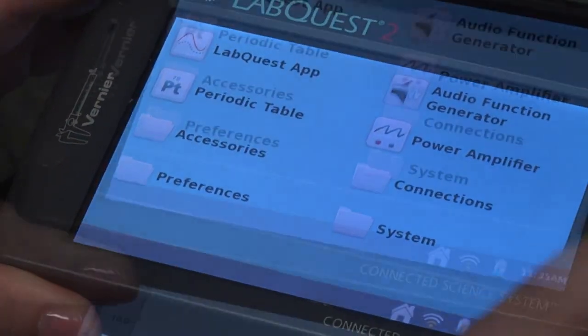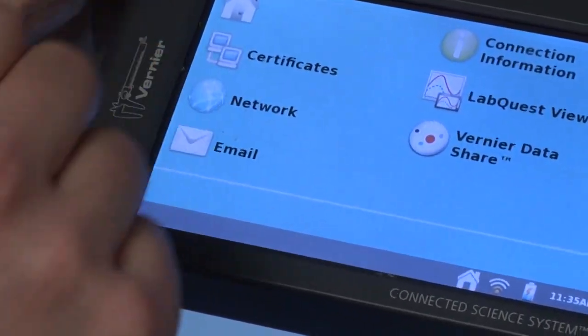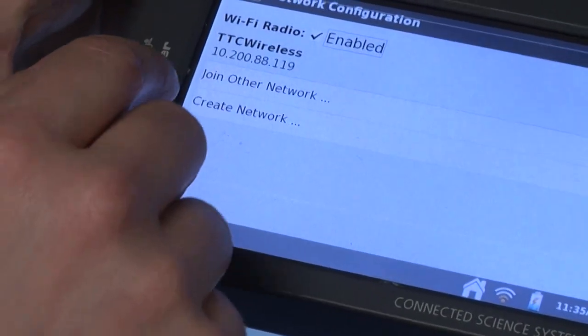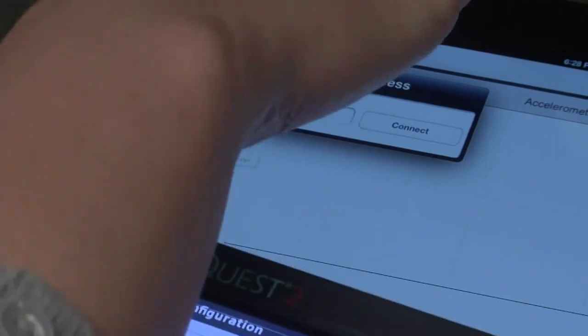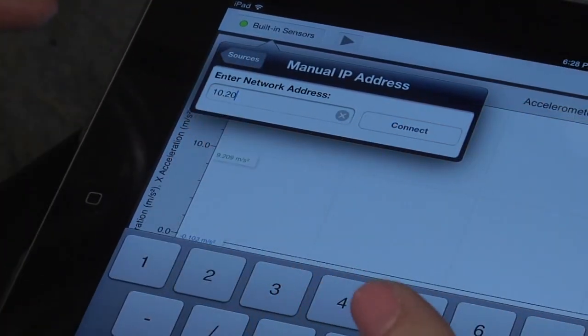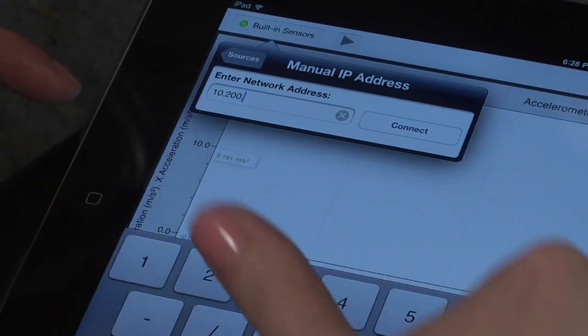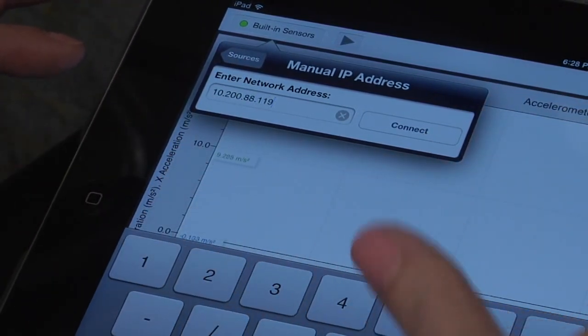Click the home button, press connection, and then network. Whatever the IP address is here, you want to type that into the iPad. So it's 10.200.88.119.